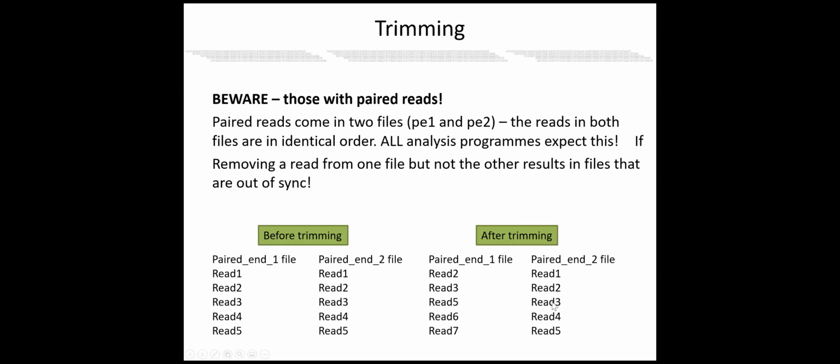It'll look like you have a tumor or something with a lot of crazy chromosomal translocations. But more likely, you're going to have a scenario where the program compares the read identifiers and immediately realizes that read 2 and read 1 were not from the same read, and it's going to throw you an error message telling you to go fix your out-of-sync files. Either one of those is going to bring you to a stop.